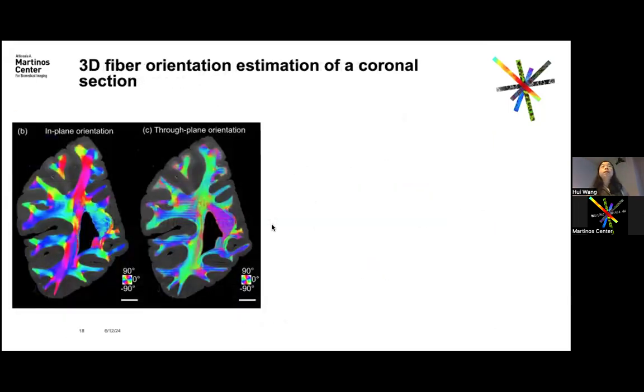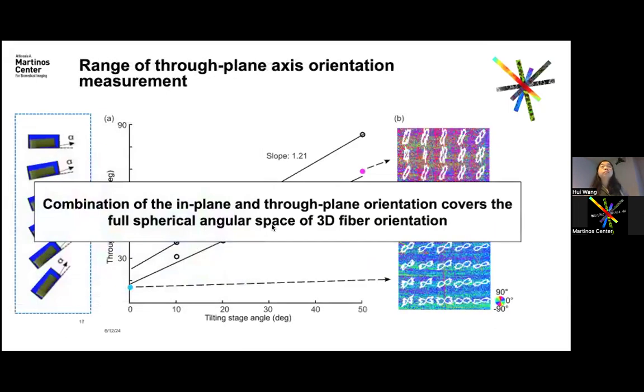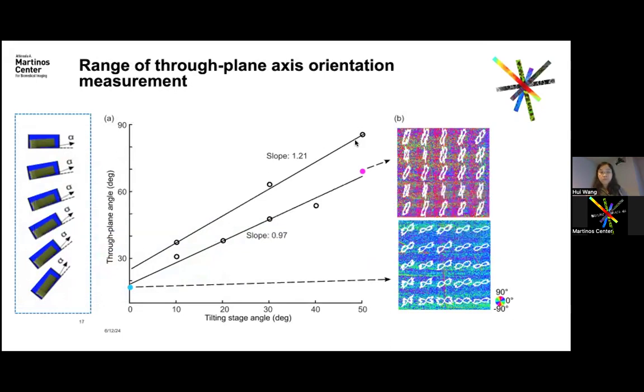So, are there limits on the steepness of the angle that this technique will work? Yes, like 50 upward. Yeah, so the 50, because we tested, the estimation goes up to like 85, 86 here at the highest point.